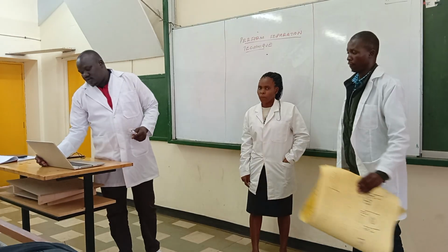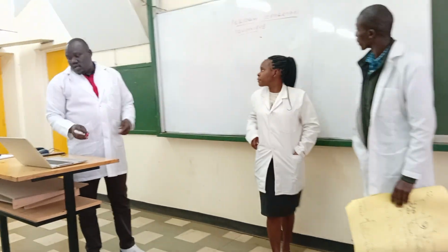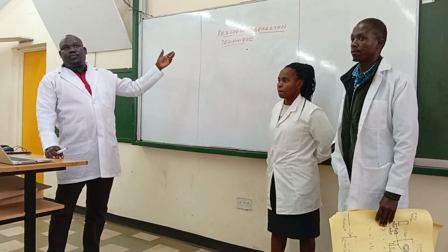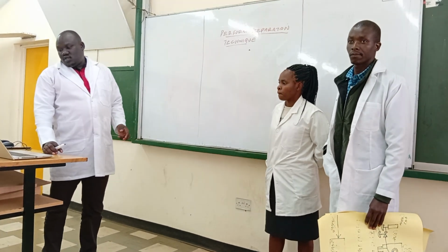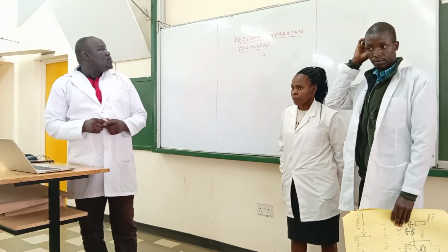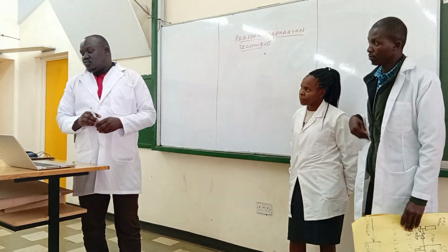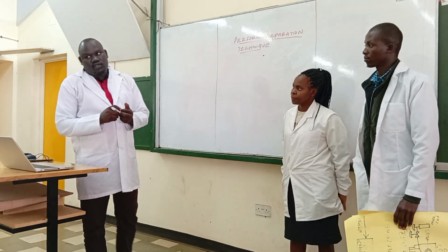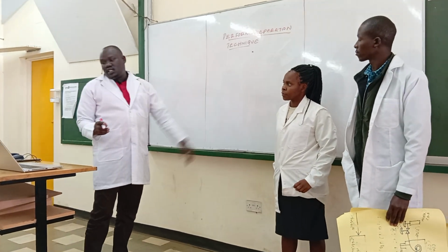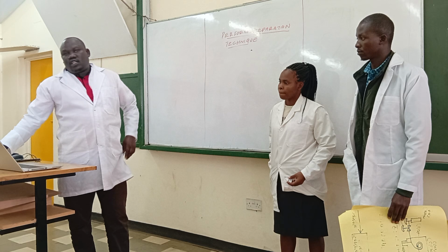What we were supposed to tackle was to perform separation techniques. In separation techniques, there are machines that are supposed to be used when you are performing them. Before that, when you are performing a separation technique, there are techniques that are supposed to be used.